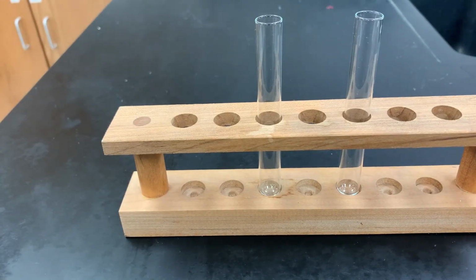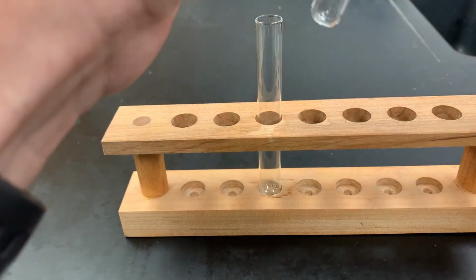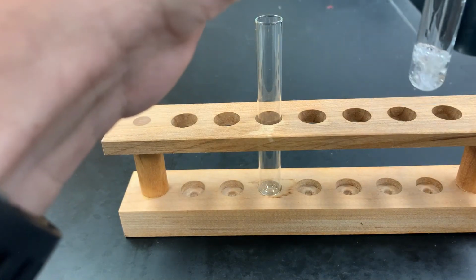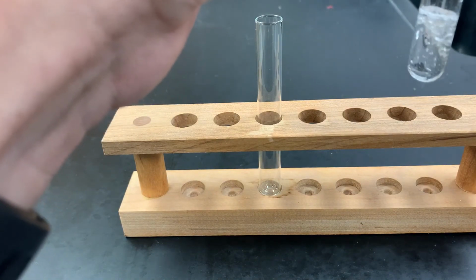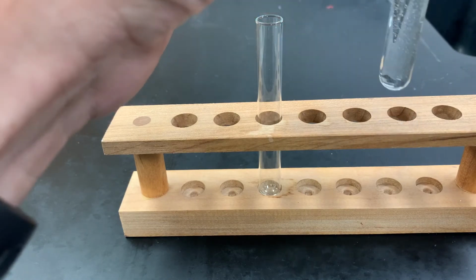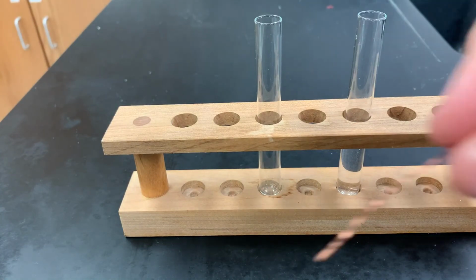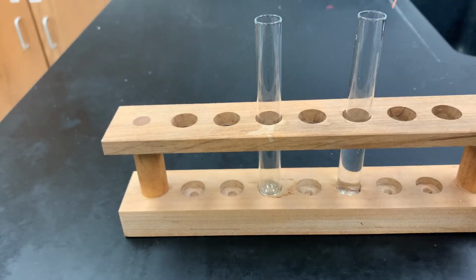For this single replacement demonstration, I'm going to take some silver nitrate, AgNO3. I'm going to add it to this test tube. And see, the silver nitrate has a clear color associated with it. And then I'm going to take a piece of copper metal. It's all shiny and copper colored. And I'm going to put it into the silver nitrate and we'll see what happens.